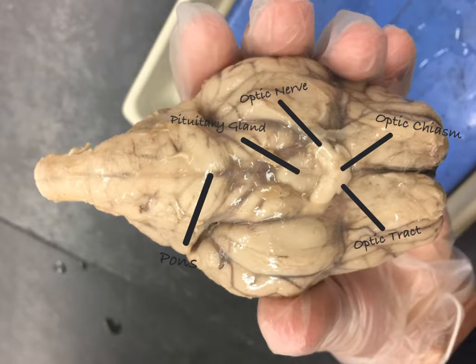Over here we have the pituitary gland, and it is basically the master endocrine gland in the sheep. Hormones are secreted by the pituitary gland, and they stimulate and control the functioning of almost all other endocrine glands in its body. Pituitary hormones also promote growth and control balances in the body. And then over here we have the pons, and it works with the cerebellum in coordinating voluntary movement.